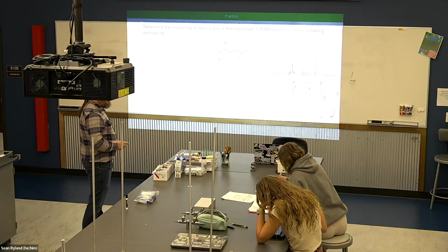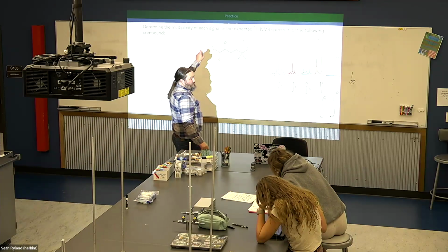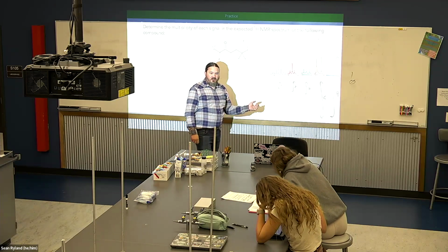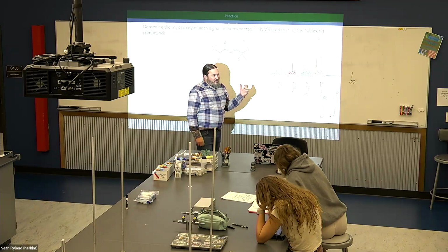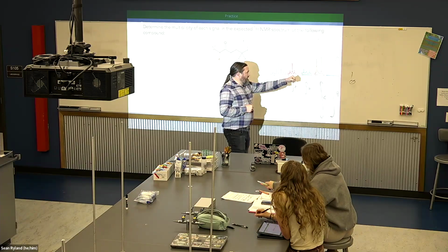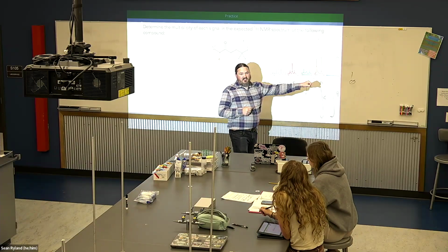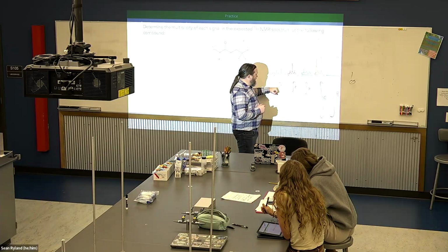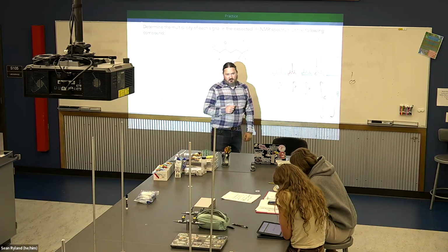So if you're systematic about it, it's actually easier to answer this type of problem than it is if I give you a real spectrum and you have to guess what the structure is. Because there's 4 pieces of information here: number of signals, order of signals, and roughly where they show up, the integral and the peak splitting.